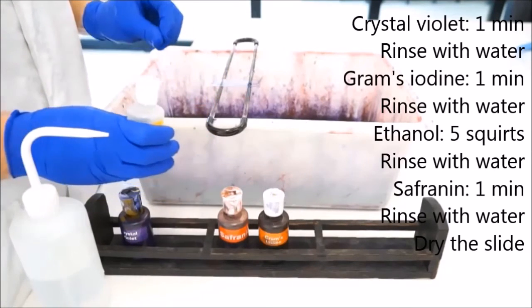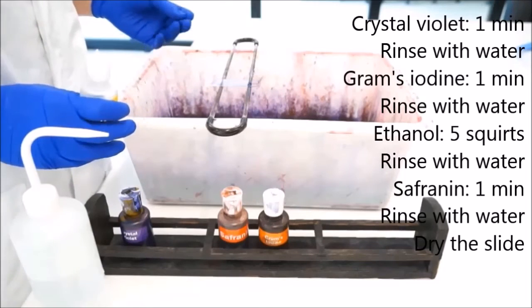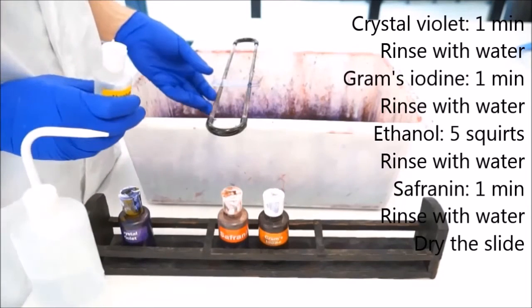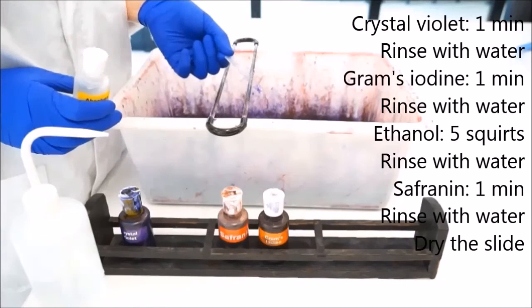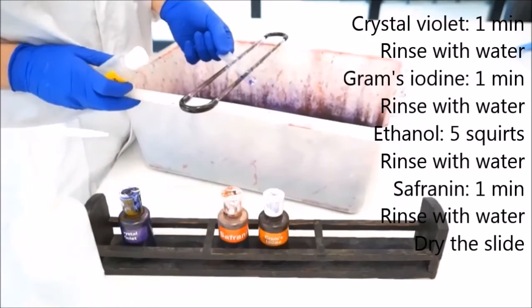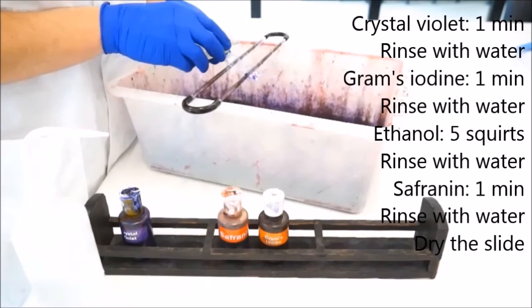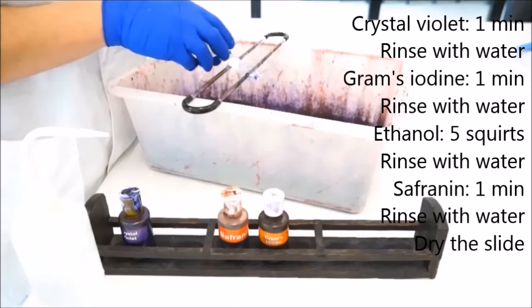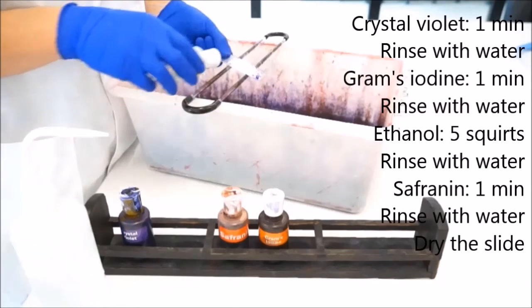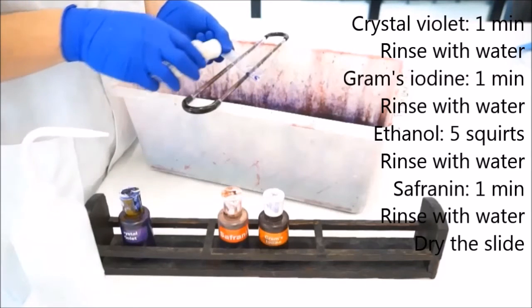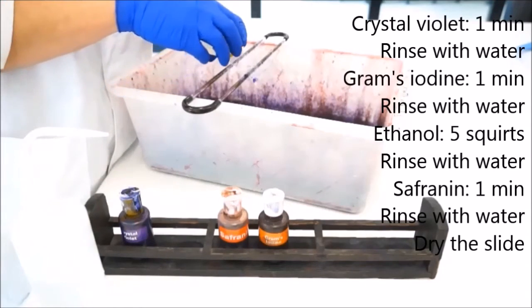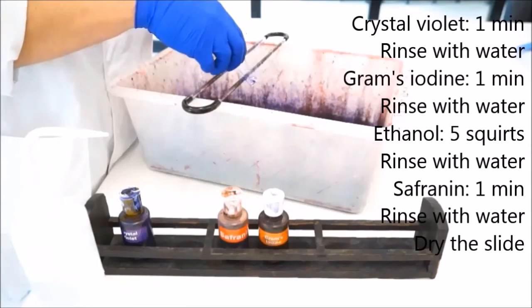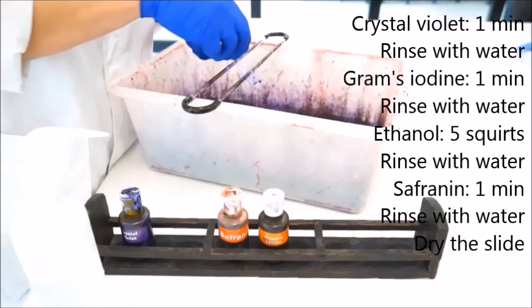Now there are various ways of doing this, but I've found the most successful way is to get your slide and put it at an angle like that and scrape the lid of the ethanol across the slide while squirting and count five times. So we've got one, two, three, four, five.